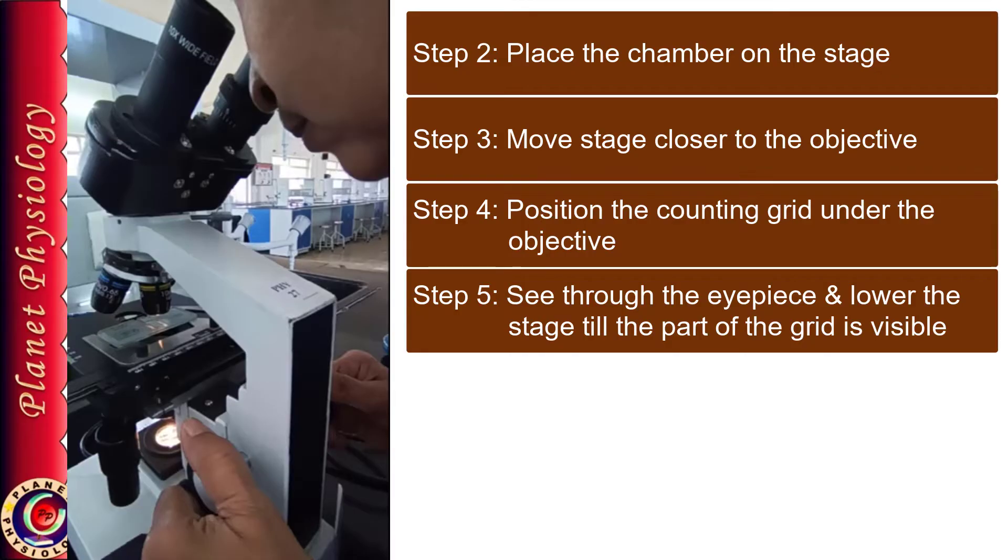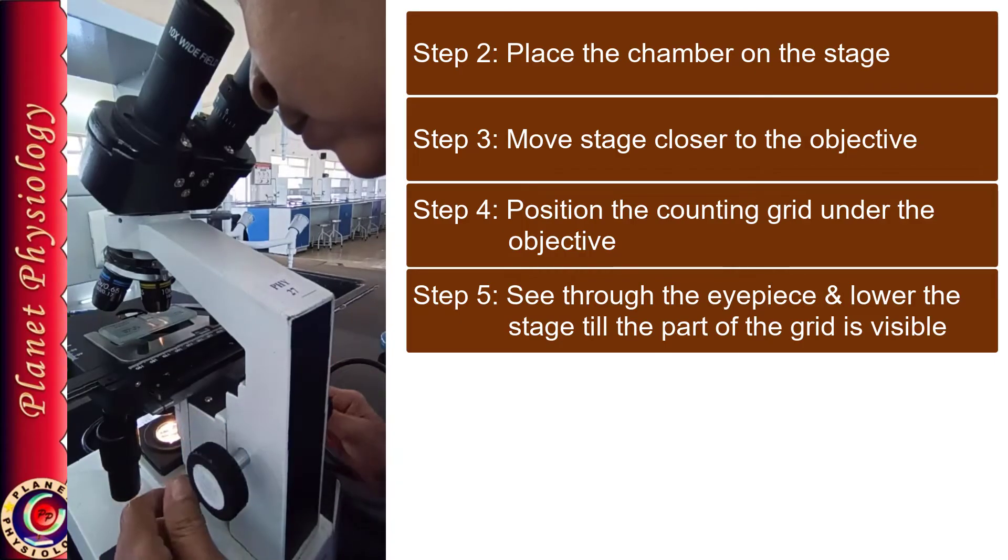It may be any part, you are not sure which part will appear. So till you see some part of the grid, continue to increase the distance between the objective and the stage. Once some lines are visible, now clearly focus that particular part of the grid with the help of fine adjustment screw.